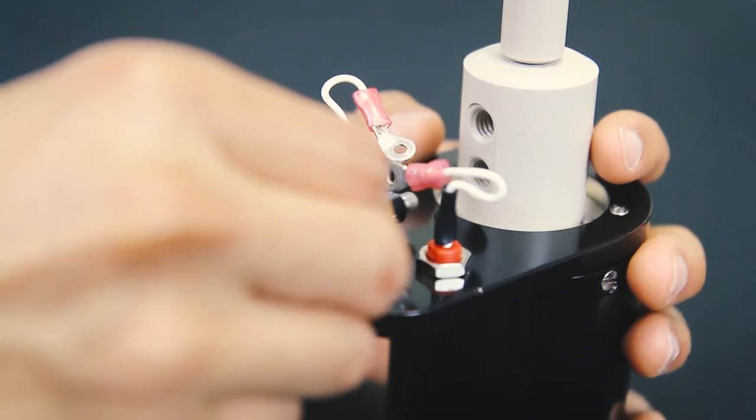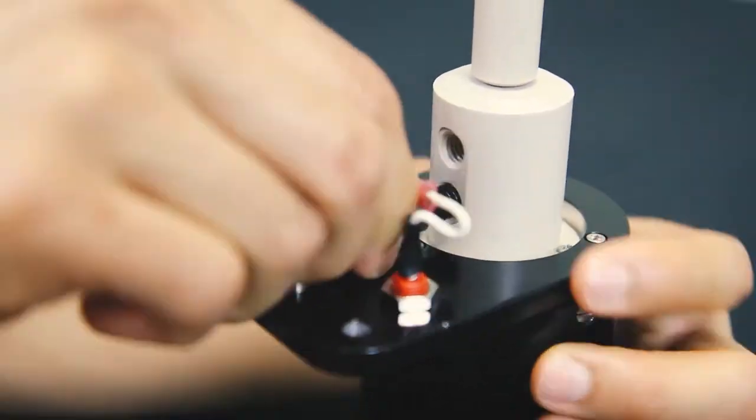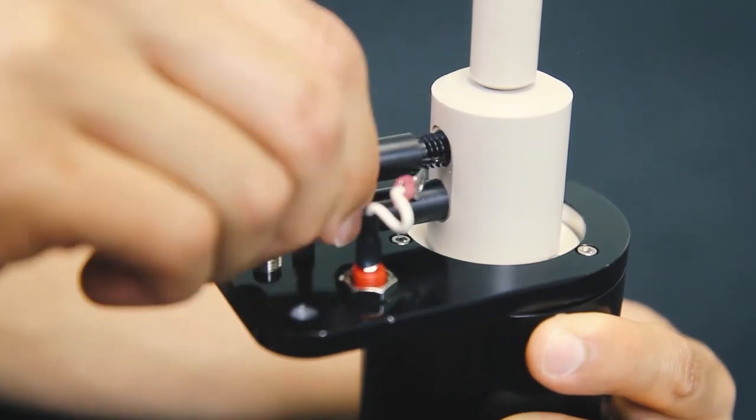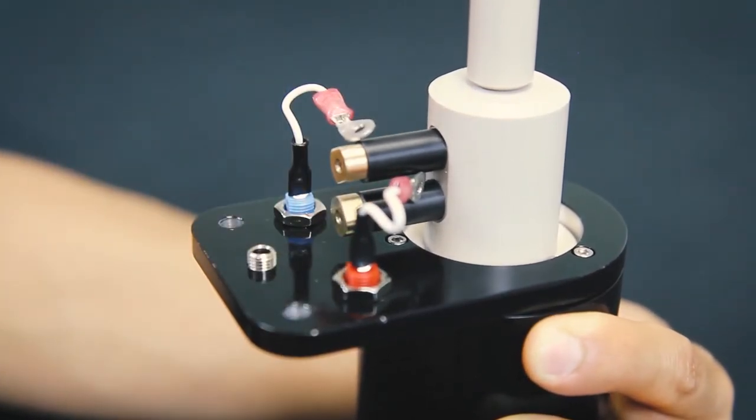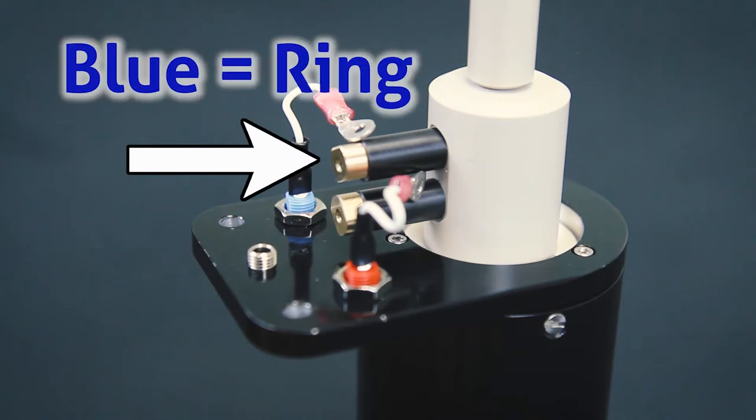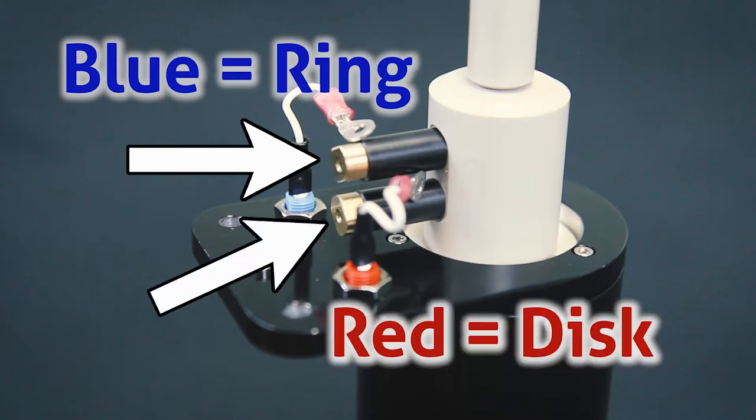Next, install the brushes using your fingers. Note that the brush that is closest to the shaft connects to the blue contact wire, the ring electrode, and the brush closest to the motor housing connects to the red contact wire, the disc electrode.